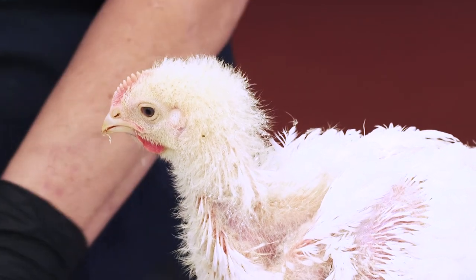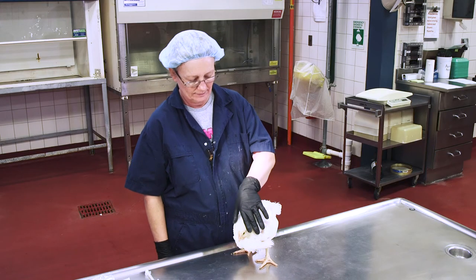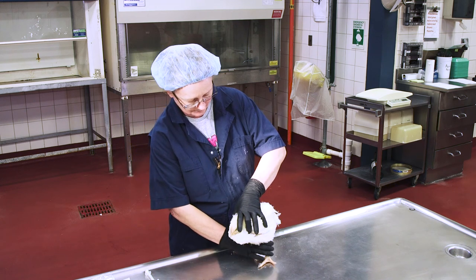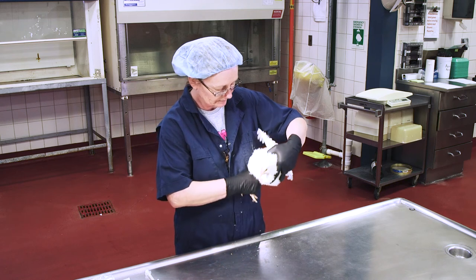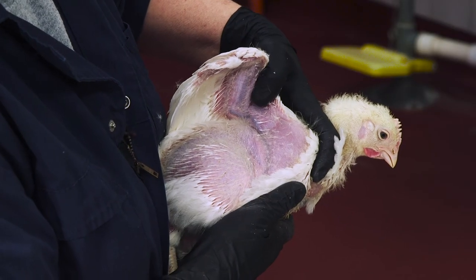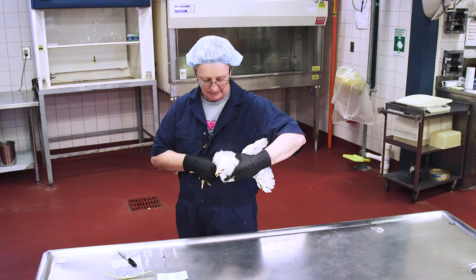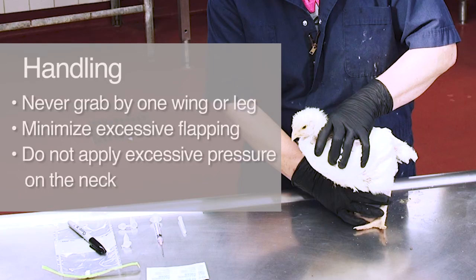Next, let's look at how one person can perform the procedure on their own. Here, we're using a broiler chicken that is about four weeks old. To initially pick up the bird, grasp it gently with two hands — one hand underneath the body restraining its legs between your fingers and supporting its breast, and the other hand coming over the top of the bird with a finger going under each wing to restrain and support the wing. It may struggle, so hold it closely to your body for several moments until it calms down. You should never grab a bird by one wing or one leg. Try to minimize excessive wing flapping, which can result in injury if the wing hits a solid object.